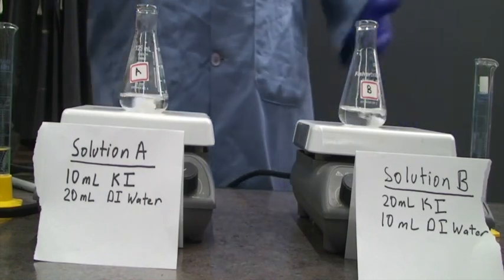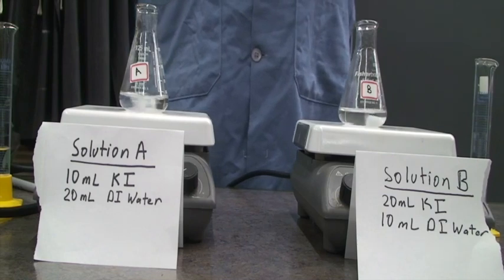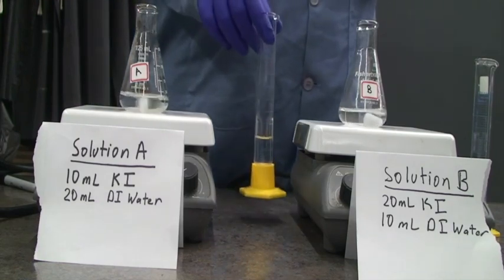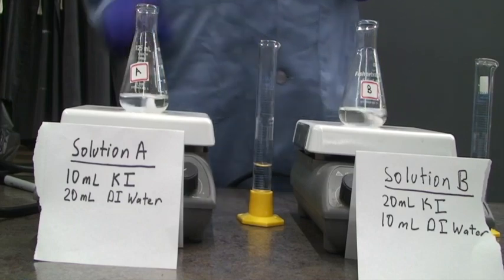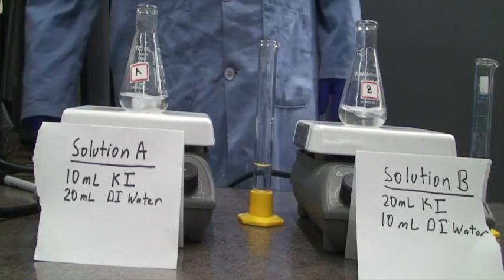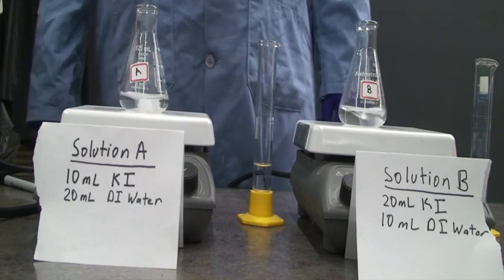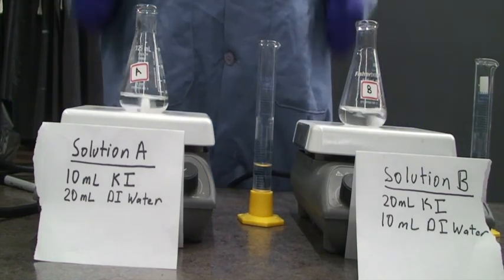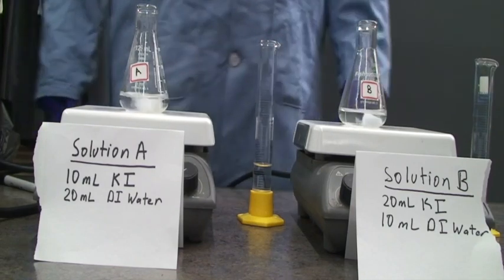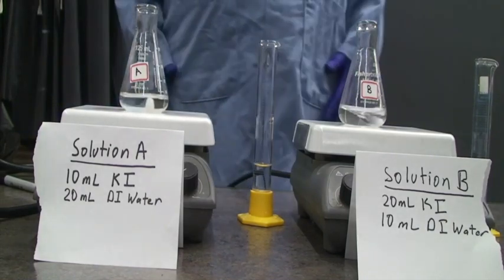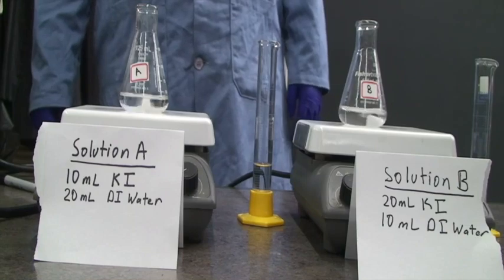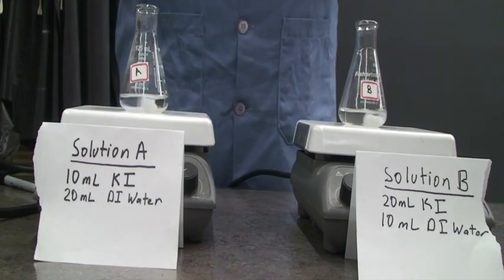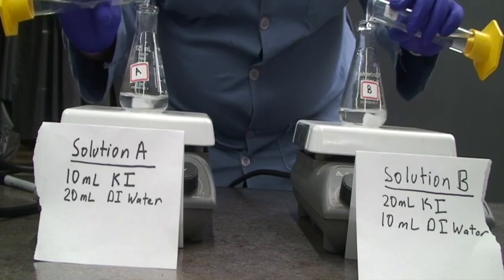To start the reaction — which is what you would do for all trials in this experiment — I'm going to add the other reagent from a graduated cylinder. I have two graduated cylinders each with 20 mL of potassium persulfate, and I'm going to add both at about the same time. We also have a stir plate and magnetic stir bars. Let's add our two reagents together and see what happens — one, two, three, go.